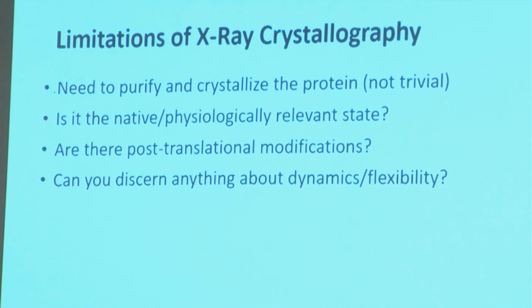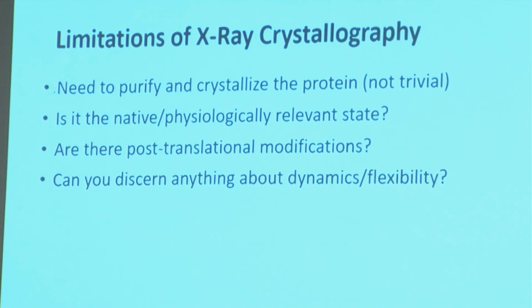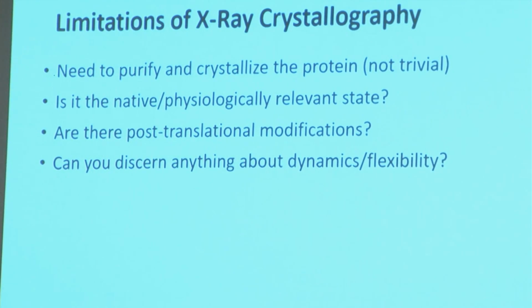All right, and one more thing. Is there any element that you cannot detect in X-ray crystallography very well? This has to do with the way, in X-ray crystallography, you're studying interactions of X-rays with electrons, right? So does anybody know?